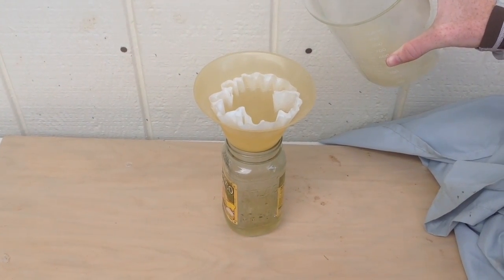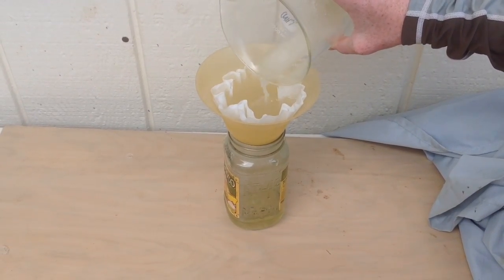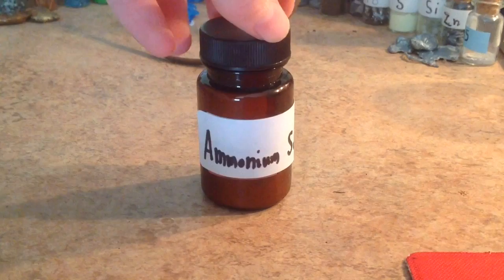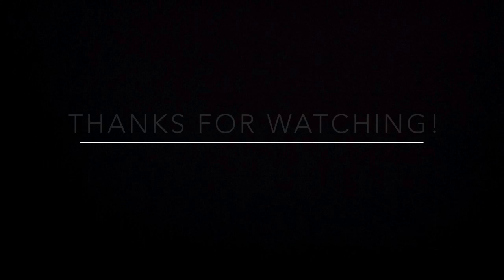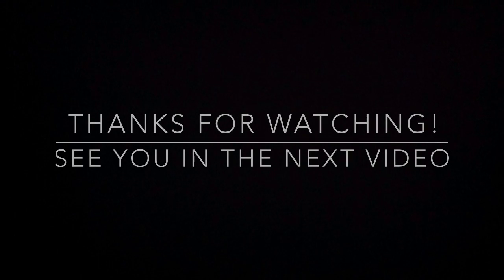All you have to do now is dry them on a paper plate or in a desiccating chamber and you have your recrystallized chemical. Thanks again for watching my video and I'll see you in another episode of Back Maxi.